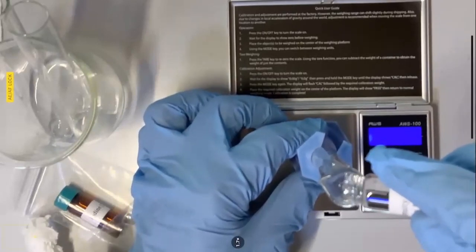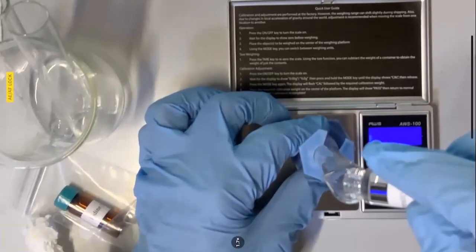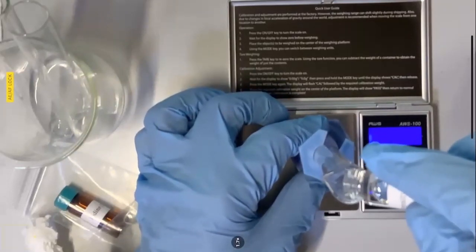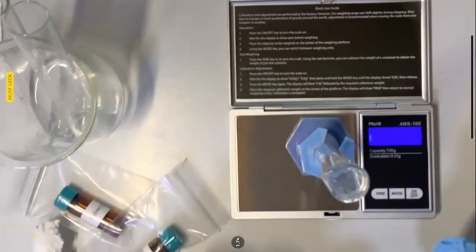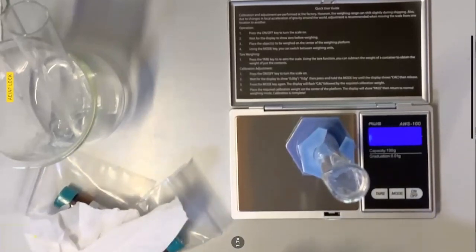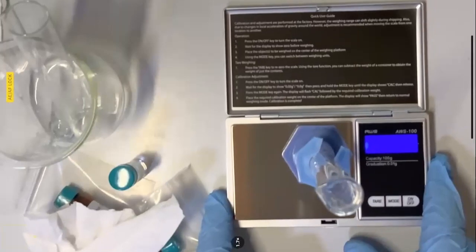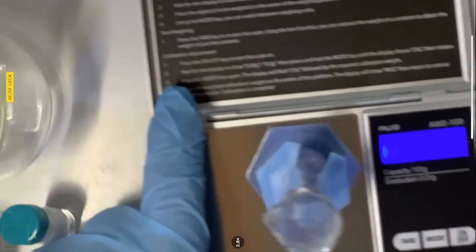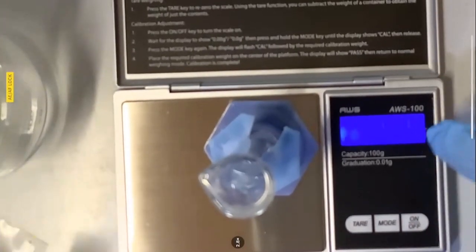And you should also take notes. This one poured more cleanly than the first. I didn't have to break the surface tension. Okay, so write down that observation. And then I'm going to record the mass right here. Oops, here it is. And you guys can't see it. I don't know why you can't see that, okay?